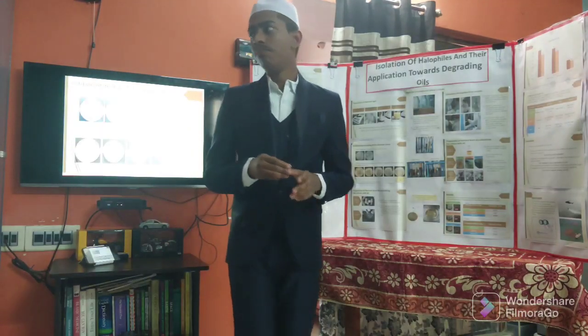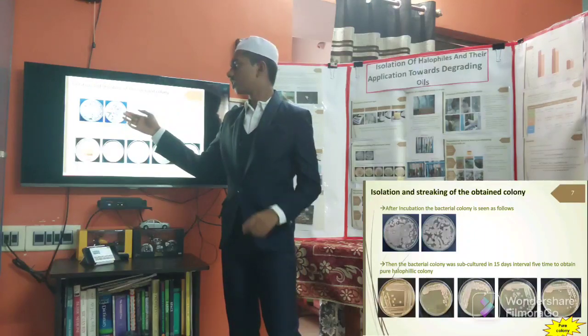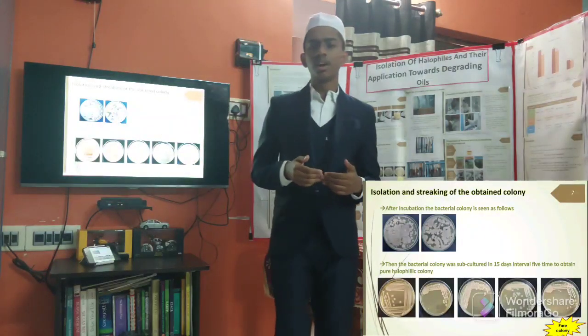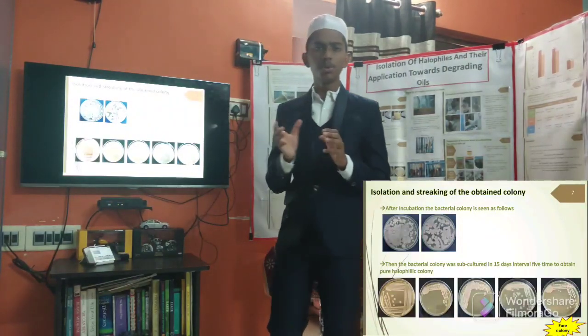After incubating, we would see the bacterial colony as shown. The first two pictures show the first bacterial colony. After this, we are subculturing it at 15 days interval for 5 times to obtain the pure halophilic colony.